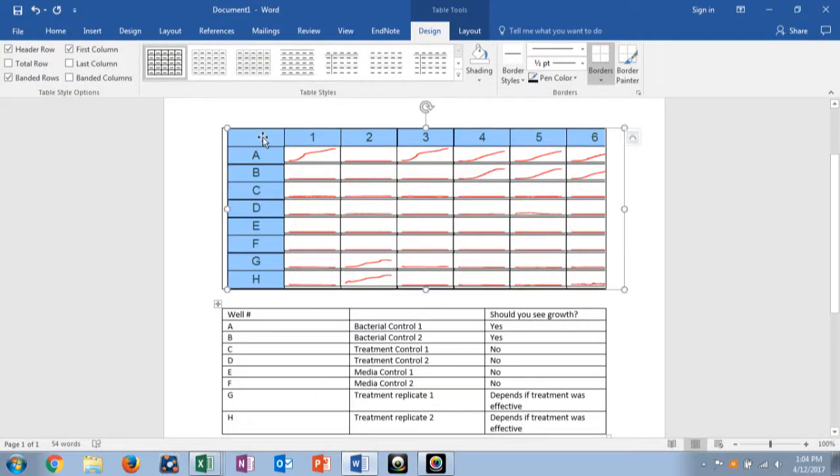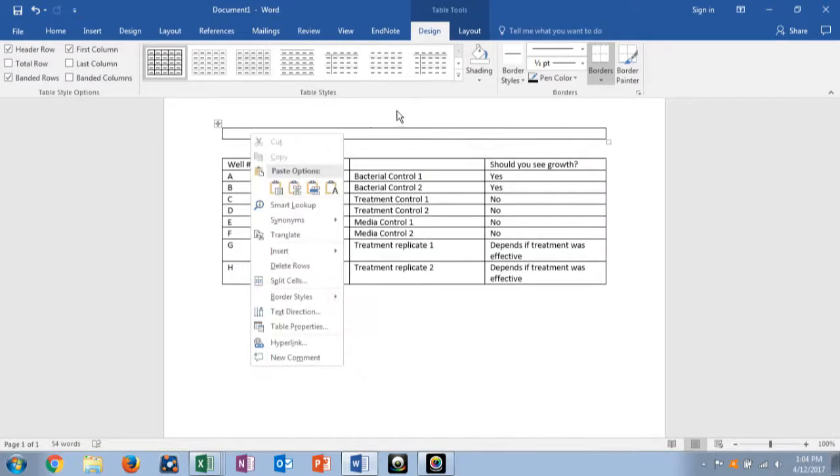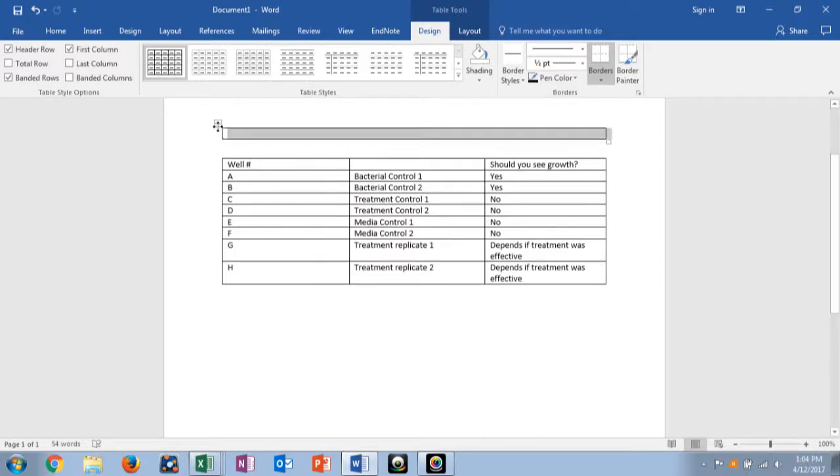We're going to copy this. I'm going to get rid of this one. I'm going to paste it as a picture. No. Okay, I don't want this. Delete.